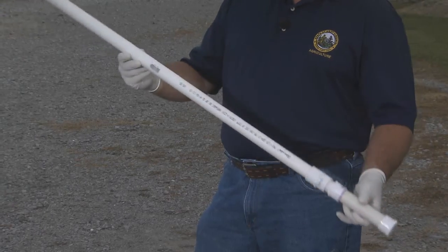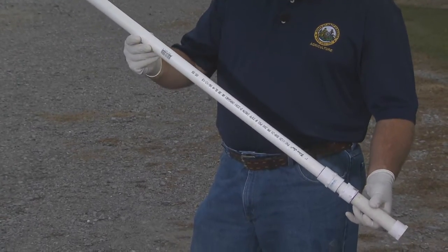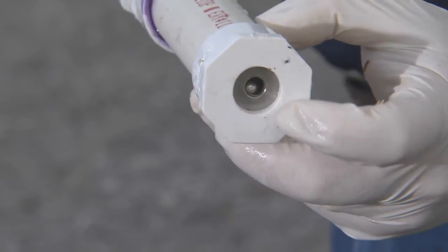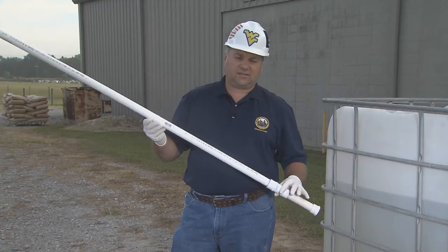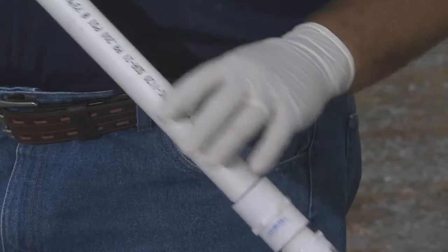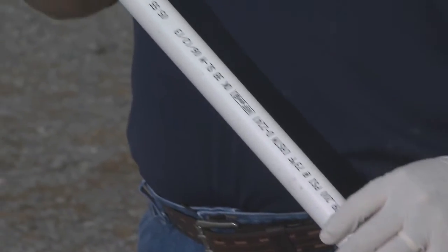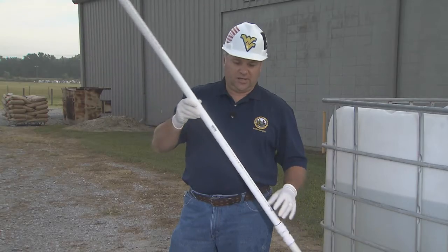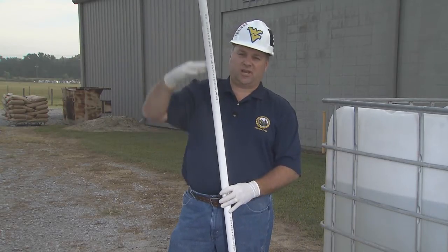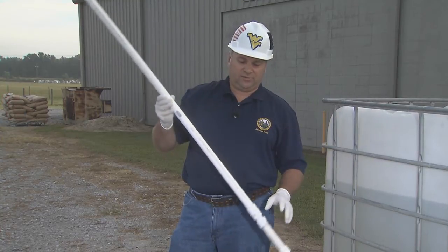A Texas Tube is only a piece of PVC pipe with a check valve in the bottom of it. Some of the pros to using this: it's simple to use. It can be used on any number of things — drums, cars, totes. You can adjust the height; you just add more sections depending on how much you need.